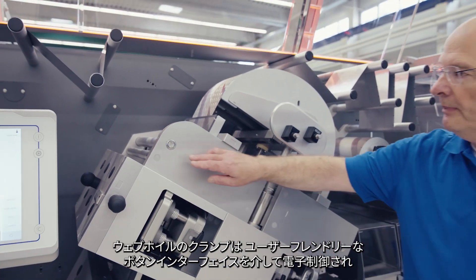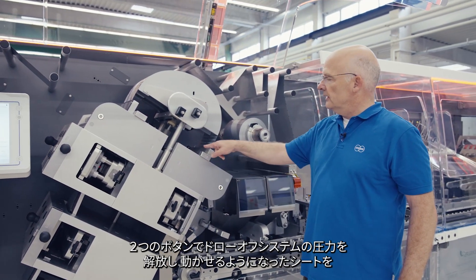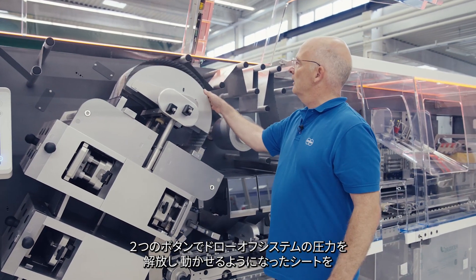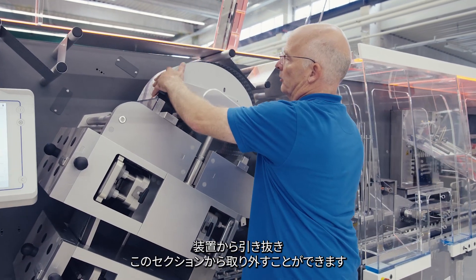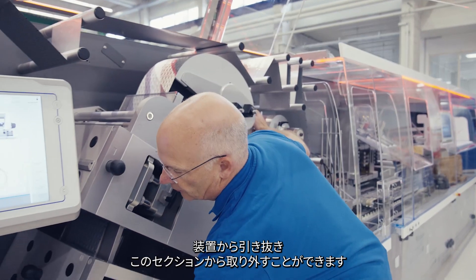The fixation of the web in our fast intermittent area is also very easy. Two buttons to release the pressure of the draw-off system, and the web is free so you can pull it out of the machine and remove it from the section.